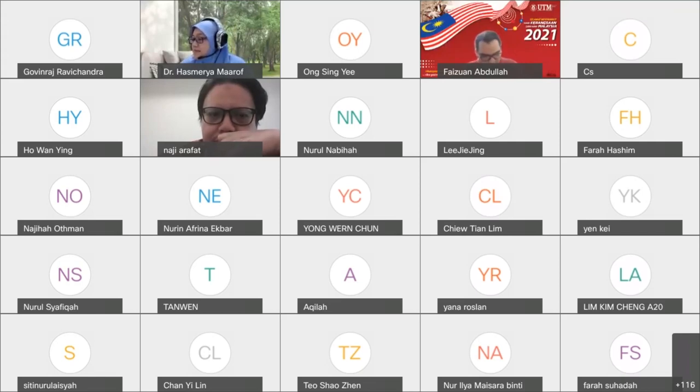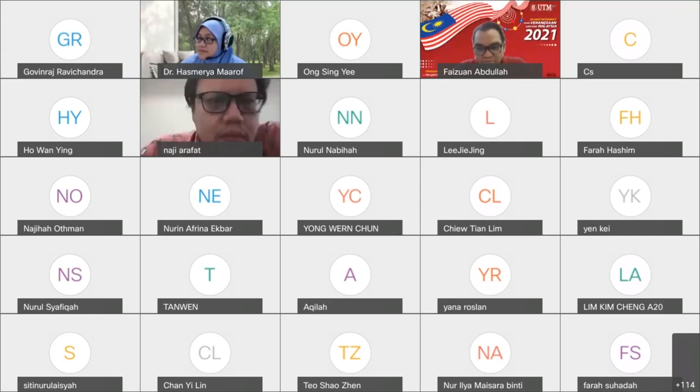For the first experiment, we're going to do the gravimetric determination of nickel. What is nickel? Guys, you can open your mic and we can have two-way communication. What is nickel? Nickel is a metal, right? What is nickel? Please, we have two-way communication. Guys, you can open your mic.